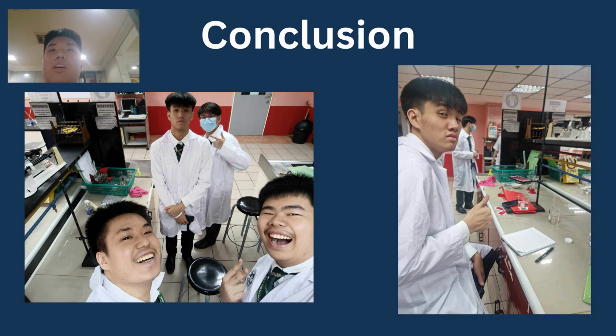Preparing solutions can be challenging. In the initial phase of the experiment, a 1M solution was created using Na2CO3 and water, which was combined with 3% hydrogen peroxide and additional water. Obtaining the precise quantities of materials required considerable time and patience, particularly due to the need for small amounts. This phase underscored the importance of using accurate measuring tools, as inaccuracies could pose hazards, especially when handling chemicals in the laboratory.